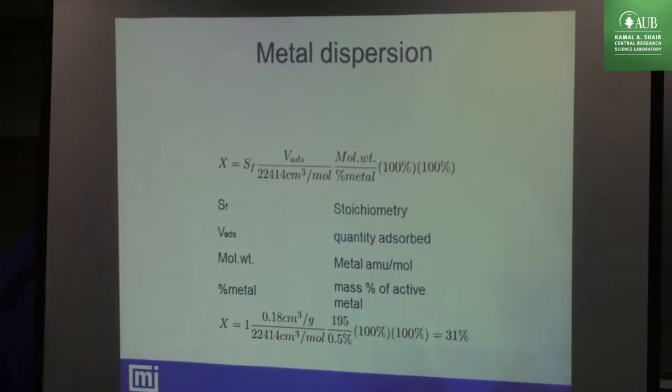metals, okay? Remember, after we calcine the catalyst under oxygen, it is oxide, nickel oxide, platinum oxide, all oxide. But the oxides are not the active species, the reduced species are the active species, okay? So when you reduce, it becomes very, very active. Now, if you have ppm of oxygen somewhere, some people, after reduction with hydrogen, use helium to clean the sample from hydrogen at high temperature. But if your helium contains 5 ppm of oxygen, okay, it's capable of passivating the nickel, the recently reduced nickel. Okay, very active.